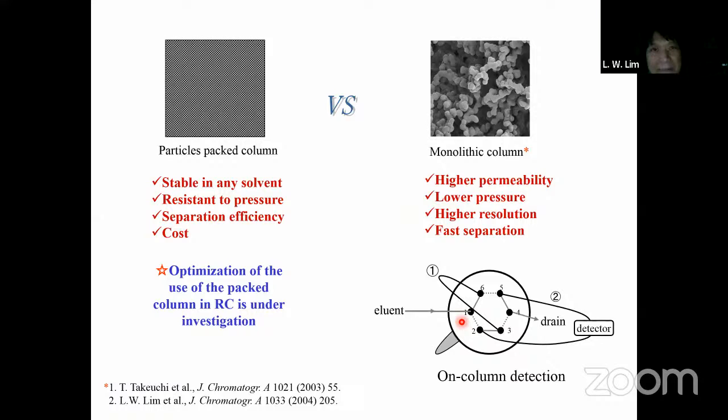Sometimes when you forget to add your eluent, the filter comes in contact with air, it will suck in some air, and that is where you get the air bubbles. Usually, if your eluent is mostly water, like an aqueous solution, you need to degas your eluent to avoid bubbles.